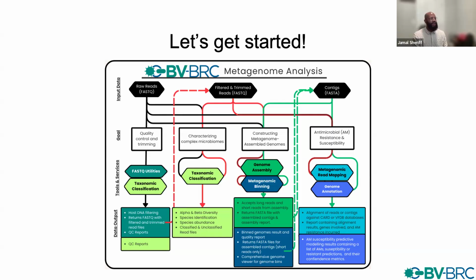We're now going to continue on with the exercise itself. The overall goal for today is getting our FASTQ files and assembling them into contigs. We'll just follow through with how I've organized this. We will obtain our FASTQ files and perform quality control using FASTQ utilities. I also mentioned in the handout how you can get some of these outputs within your taxonomic classification service.